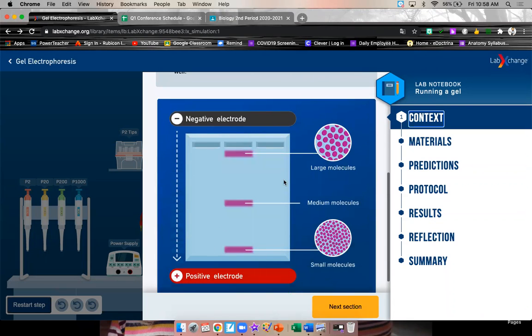Look down here. See this block? This is a type of gel called agros. And there's little wells in there. We're going to put your DNA in the well and we're going to dye it different colors. In this case, purple. That way we can't see DNA, but this way we can at least see the dye moving. This gel has a whole bunch of tiny little pores in it, like holes. Like you have pores in your skin, there's pores in this gel.